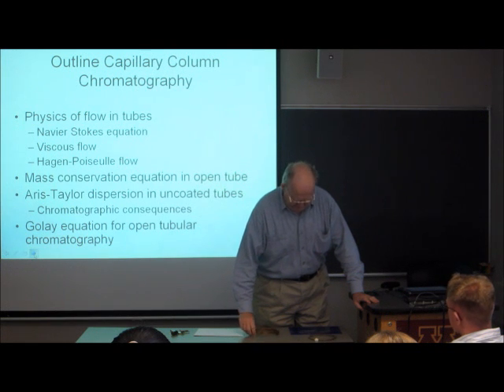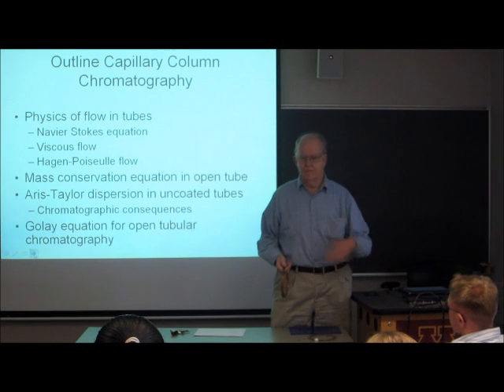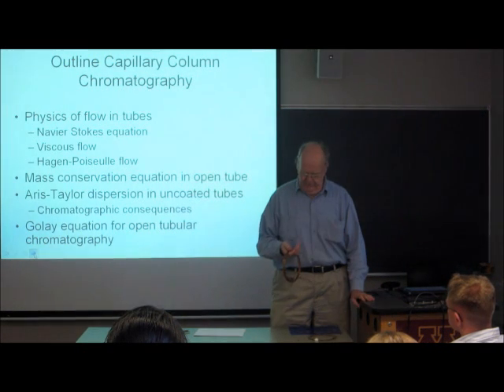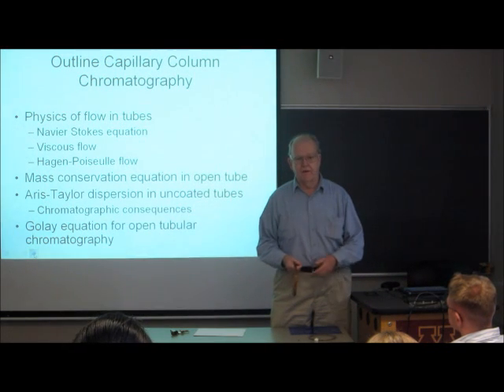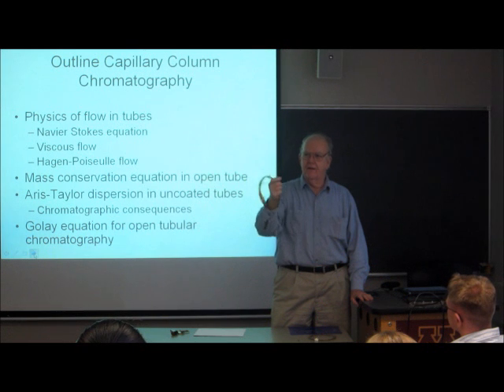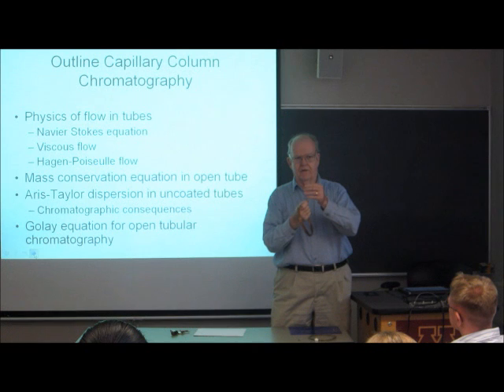In the late 1970s, after fiber optic cables were invented, a fellow who happened to work at then Hewlett-Packard Company, his name was Ray Dandeneau, said, I think I can take that technology and make fused silica capillaries out of it. And that's what he did. And this is a fused silica chromatography column. I still remember the first day I saw one of these, I said, this is going to change gas chromatography.